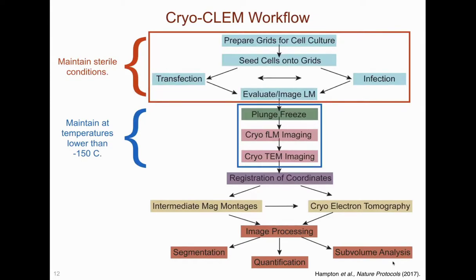Two areas within the workflow are called out with red and blue boxes for 2 reasons. First, when working with cell cultures, both eukaryotic and prokaryotic, it is critical to maintain a sterile working environment using the appropriate environmental controls and the use of aseptic or sterile techniques to eliminate possible sources of sample contamination.